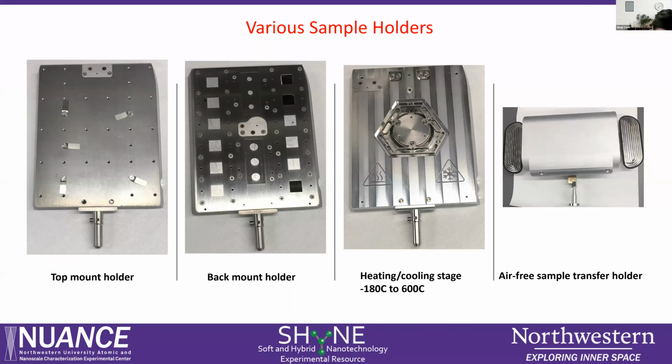Okay, so that is for depth profile and the mapping. And we have this instrument, we have several holders. This is a top mount. The sample we can mount here, and then we can use this clip or use a tape, double sticky tape. This mount and the sample and height have to be less than 1 centimeter. This is pretty high. But they use the top mount, have to be careful and not touch the lens.